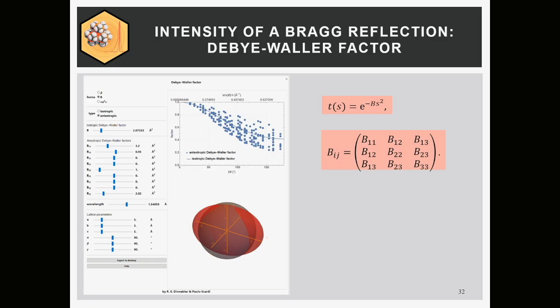Debye-Waller factor, I don't want to say too much about. This is actually the picture of one of the many Mathematica scripts we included in these papers. So you can see how it works, isotropic or anisotropic, how the displacement parameters work. You can click on these different points and see what happens if you make it anisotropic. Put it this way: if you make your Debye-Waller factor anisotropic, you can easily fit an elephant. So for powders, you're only allowed to do this under very special circumstances.